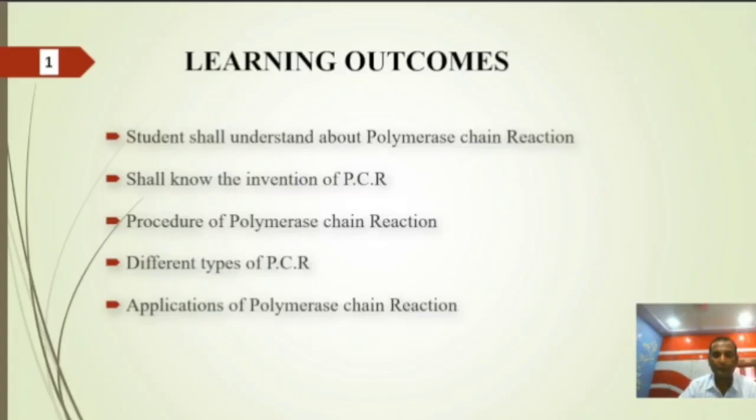Now, the learning outcomes. Students shall understand about polymerase chain reaction. They shall know the invention of PCR method. Students will understand the procedure of polymerase chain reaction. They will know the different types of PCR techniques, and they will also understand the application of polymerase chain reaction.